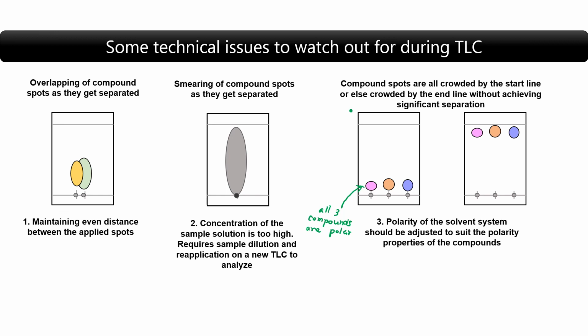And what does this say about the solvent system? It means the solvent system was not sufficiently polar in order to make these three compounds obtain a significant separation.